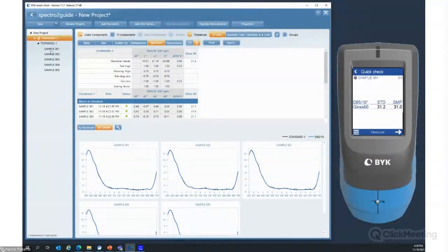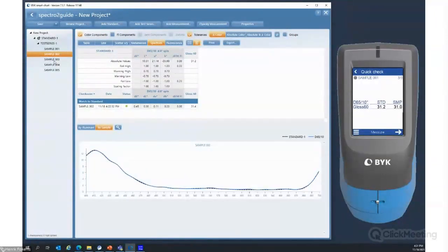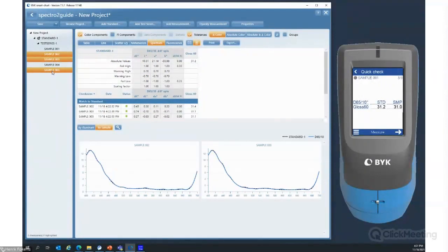Often customers are just measuring samples, so they have not defined standards. The idea is to define a standard out of some samples, for example. So here, this option is possible when highlighting maybe this sample, and this sample.